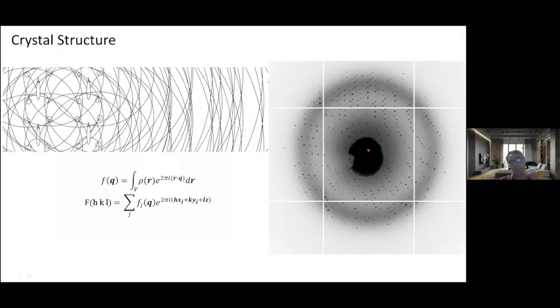Looking also going all the way to the other side, doing crystallography. Let's say you have all these water striders and they're all perfectly aligned on a grid. Not only do you have the scattering from that single molecule, but you also have the order that's between the water striders. And you know, having many gives you a lot more signal than one. That's one thing that's great about crystals, is that there's a lot of copies, and they're also organized relative to one another.